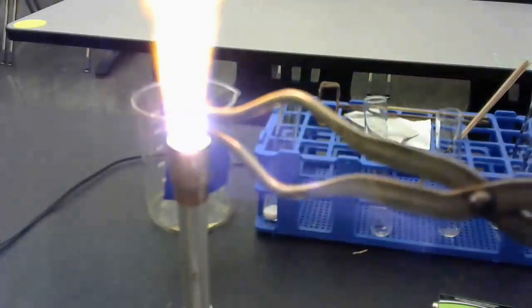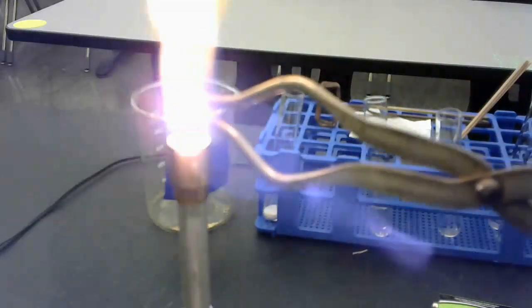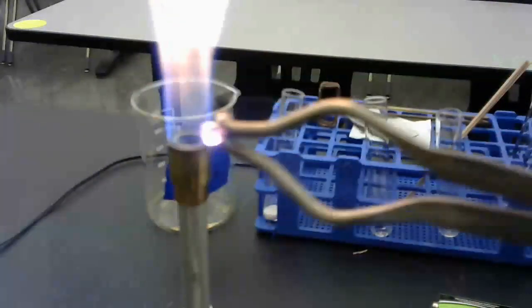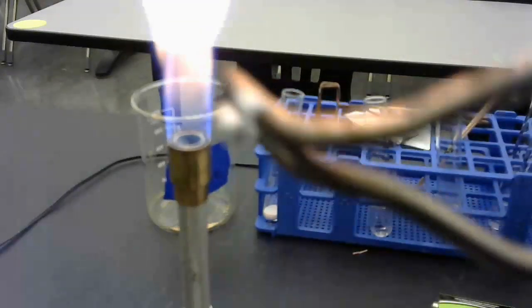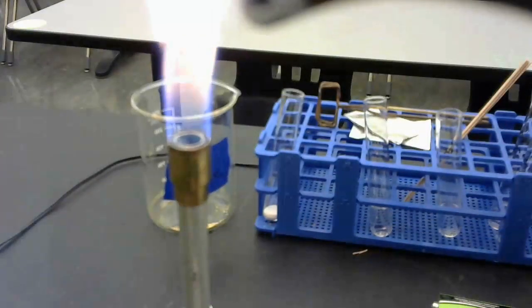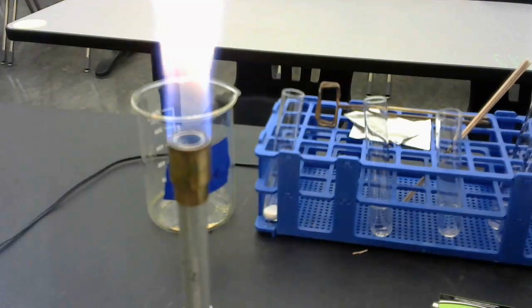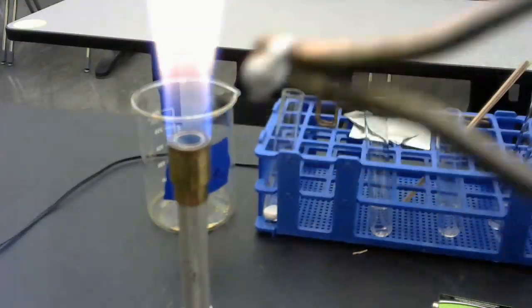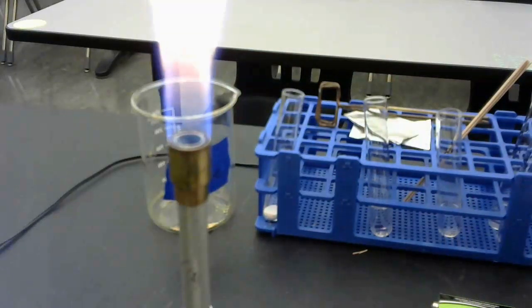And there you go. It makes a super bright white flame, okay? A super bright white, and then what's left is a white powdery material, if you can see that. So make your observations on that. We had a very bright white flame, and then you had a solid white powder left over.